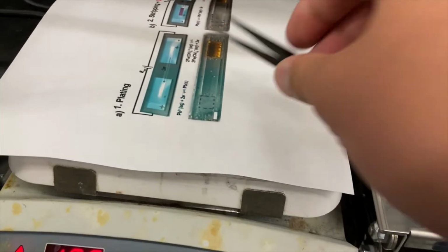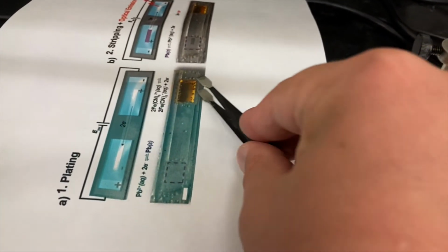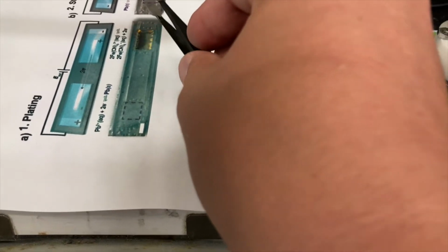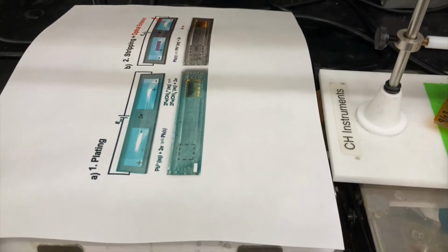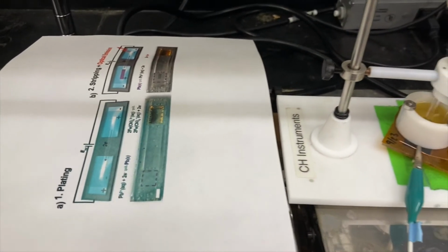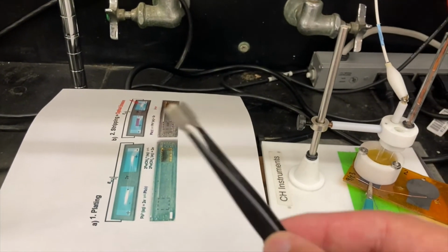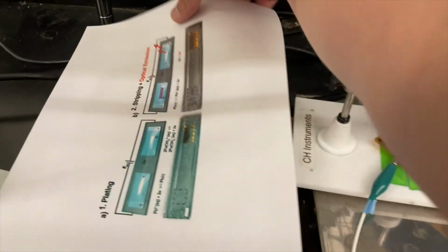And you'll just want to ensure that the whole area you'd like to melt is exposed to the hot plate and goes through that slight color change. But make sure not to touch it or your fingerprints will get onto the surface of the wax. When you're ready to pull it off, if you're using a smaller piece of paper, you can use these flat tipped tweezers, but I'll just pick it up by the part that's not touching the stove.